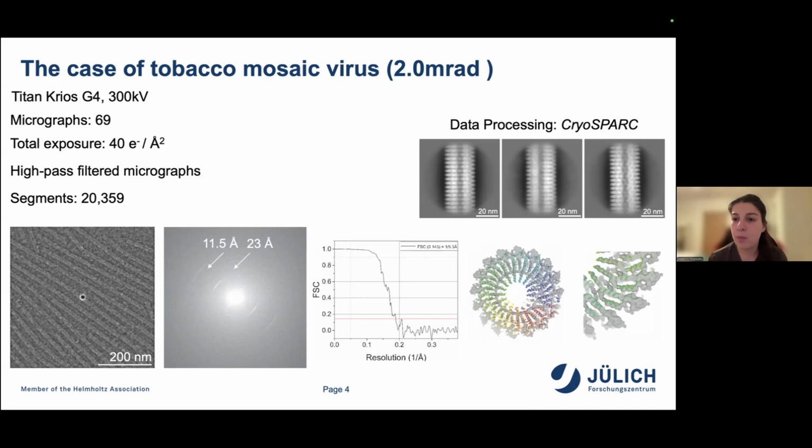The total electron dose was set to be identical to the typical dose for cryo-EM. And then before processing, we high-pass filtered the micrographs to get rid of some artifacts that are provoked from the nature of the detector. And here you can see a micrograph that is high-pass filtered.